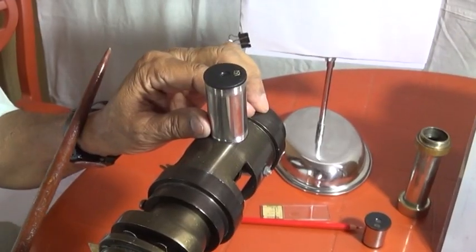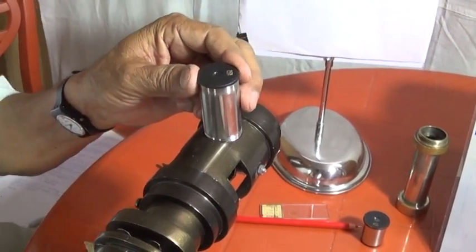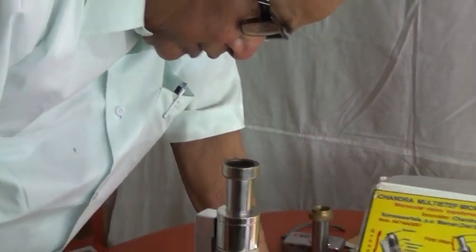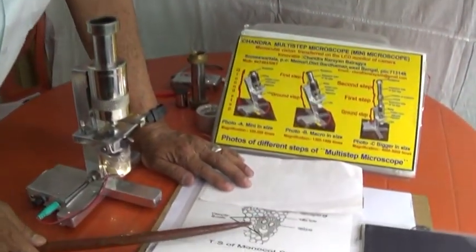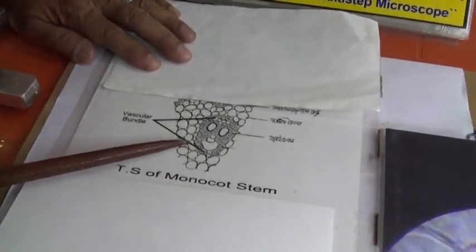If we view through the eyepiece of first step, we can get 1000 times magnification. We are observing the structure of the cell wall. We are observing the image of the only one vascular bundle instead of many vascular bundles.